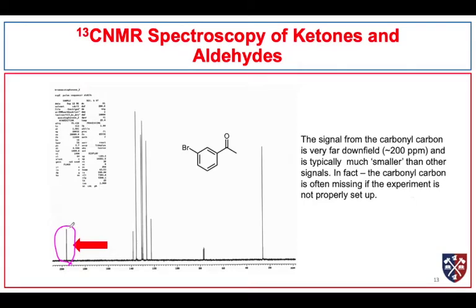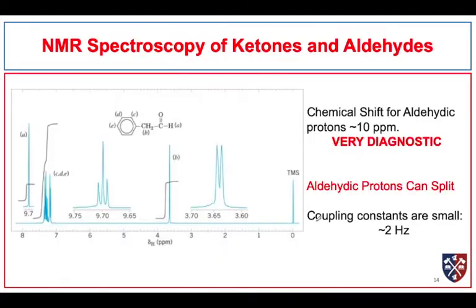Sometimes we need to adjust our experiment to make sure we capture the carbonyl carbon signal. If we expect an aldehyde or ketone but don't see a peak around 200 ppm, we may need to change the NMR parameters, because those signals can sometimes be hard to capture.